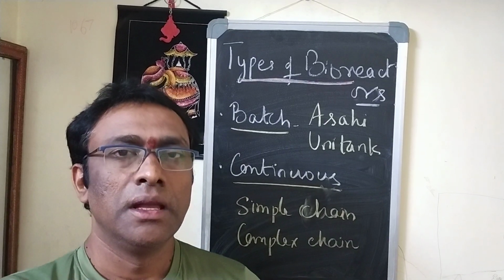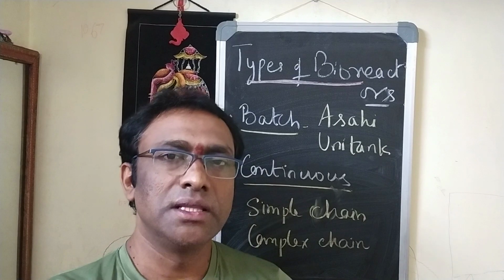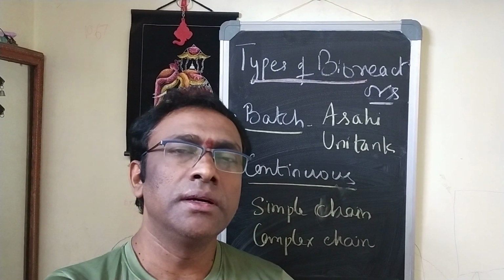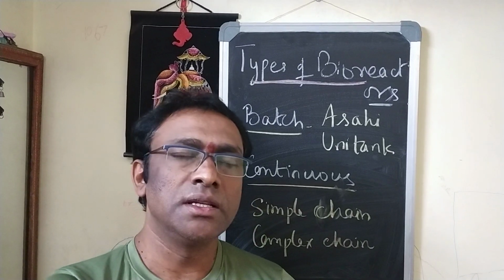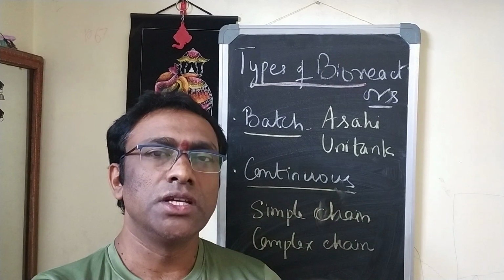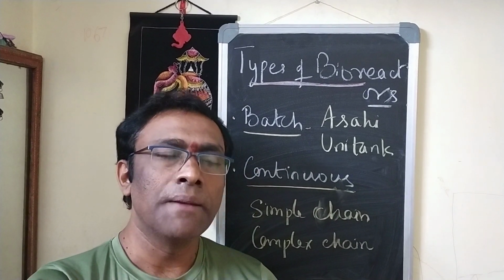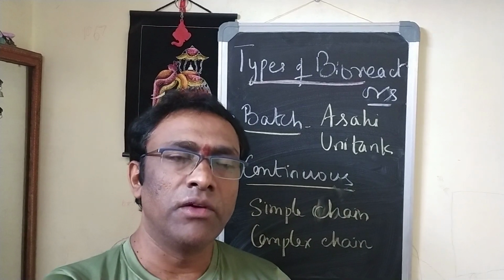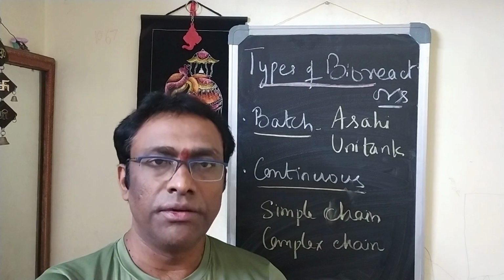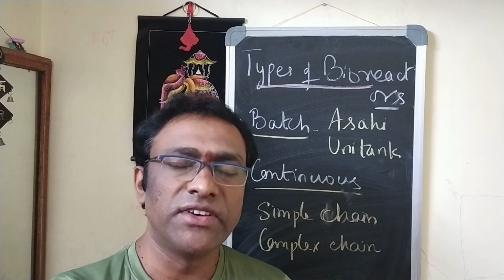Hello students, we are back for the study of the topics in industrial microbiology. In the previous sessions we have looked into the basics of the fermentation industry, the crude media formulations, and then the agitation. Agitators we'll be discussing separately, impellers and all in the coming class. We have also studied heat and temperature regulation, monitoring and regulation processes, and oxygen transfer rates.